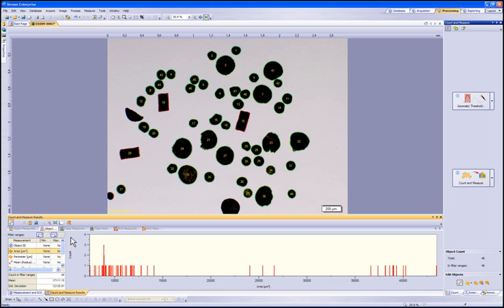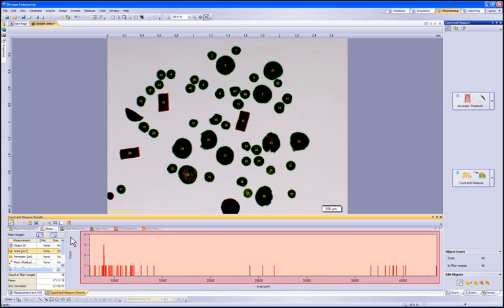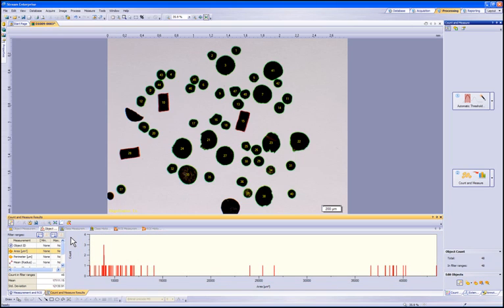Filtering can provide a way to exclude or include particles of interest. You simply select the measurement, then select the minimum or maximum filter range to allow you to manually select the minimum or maximum particles. Or you can manually adjust the sliders within the histogram to include or exclude certain ranges. We will not be applying any filtering to this evaluation.